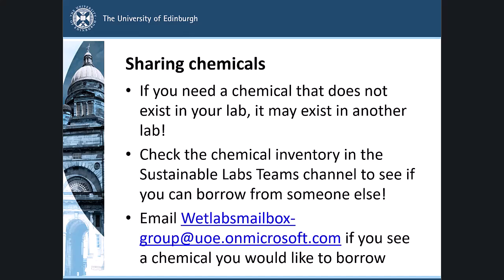In the School of Engineering, we are committed to using our resources in the most sustainable and cost-effective way. Because of this, we try to share chemicals between research groups and labs as much as we possibly can. If you need a chemical that does not exist in your lab, check the school's chemical inventory on the Sustainable Labs Teams channel or the school wiki to see if the school has it elsewhere. If we do, email the Wet Labs technical team who are responsible for chemical stocks, and they will arrange for you to borrow the chemical if this is possible.